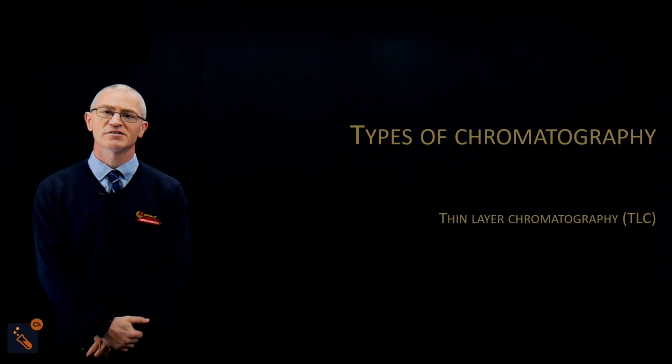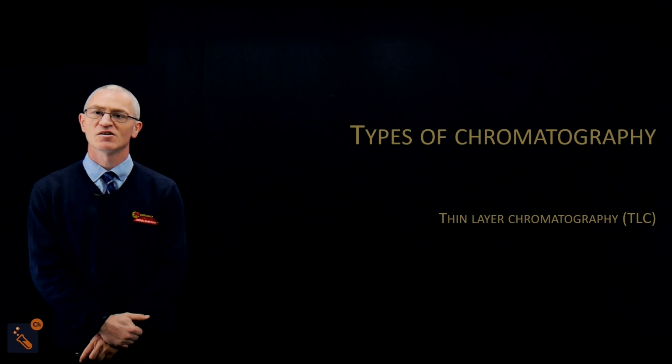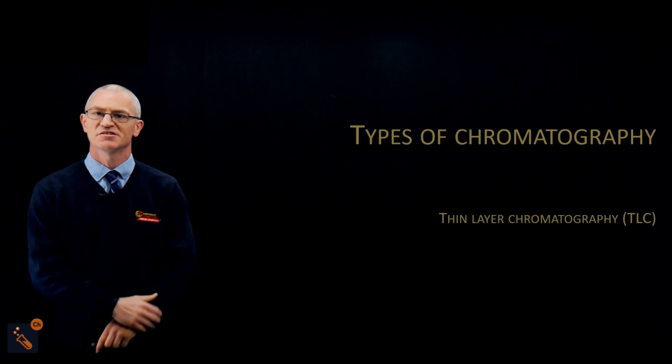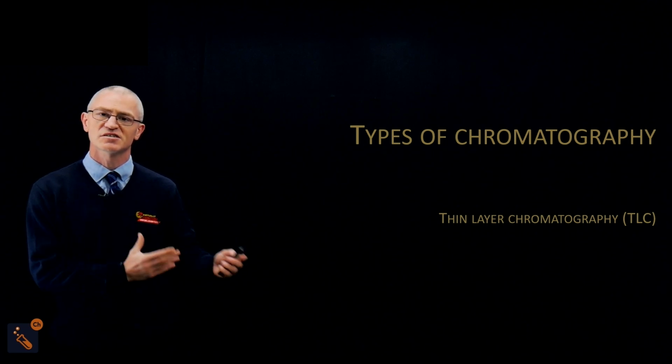In this video, we're going to talk about types of chromatography, specifically thin layer chromatography, often called TLC. We are going to talk about what TLC is and explain how it works, but mainly it's about interpretation again. Just like with gas chromatography, it is about interpretation of your results. And we'll discuss this further in the exam style questions video that follows this.